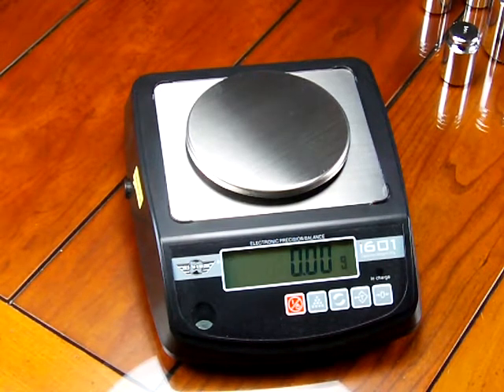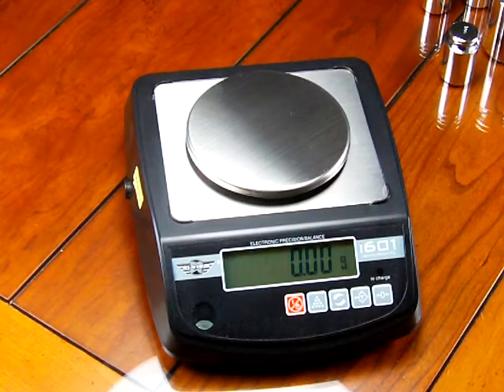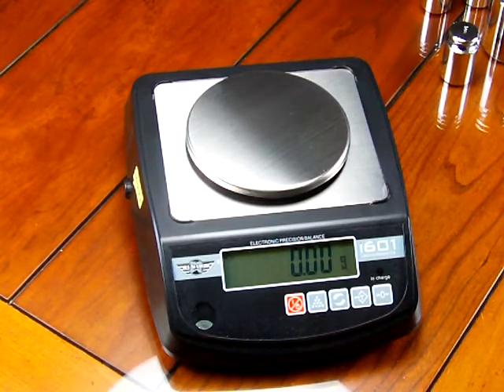In this video we'll be demonstrating the MyWay i601 digital scale. We're Precision Weighing Balances and if you want to see this product or purchase it, you can go to our website either www.balances.com or www.scaleman.com.